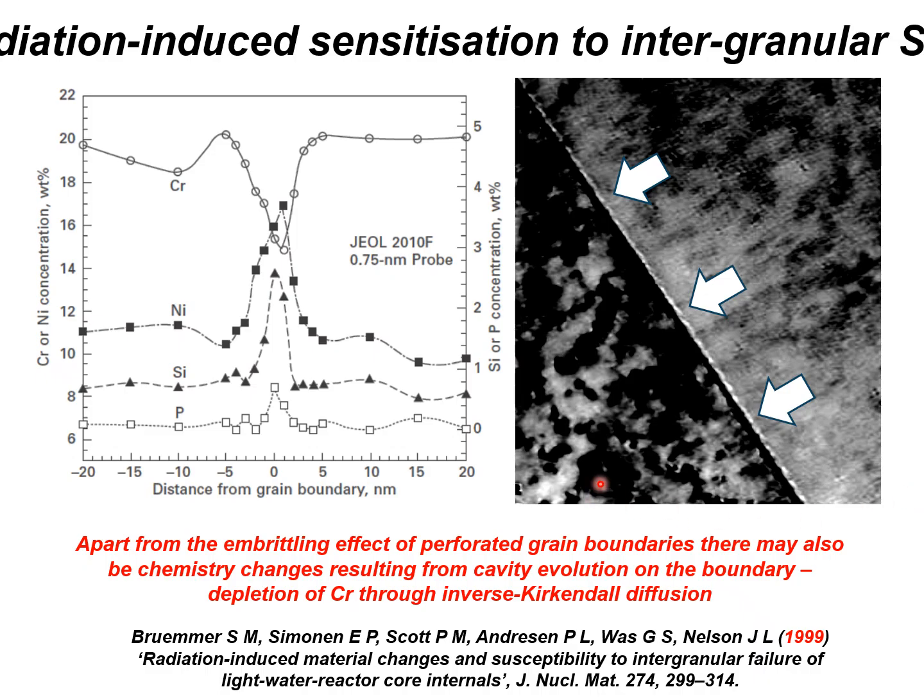And I'm looking at the micrograph and I said, ooh, that looks like your objective stigmators are slightly misaligned, but you've got enough contrast, and maybe a shift in the image from where these things sit, to make out bubbles. But I don't think that was recognized at the time. I'm stating it now. I think that's evidence that the grain boundaries have bubbles aligned along them, or the boundaries are perforated by bubbles.